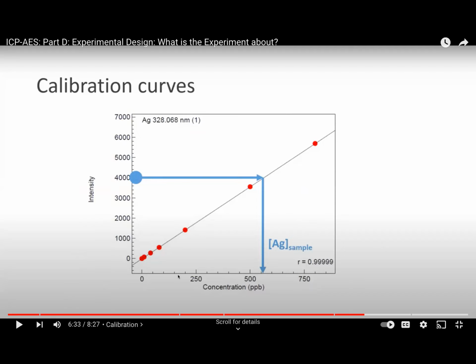But of course, you can use the commercial standards, just like he mentioned before, the multi-element standards. So these standards you have to buy if you want to mix a few elements at one time. So it's difficult if you want to prepare your own standard solution if it is a mixed-element sample. So you have to use multi-element standards. So I think that's it.